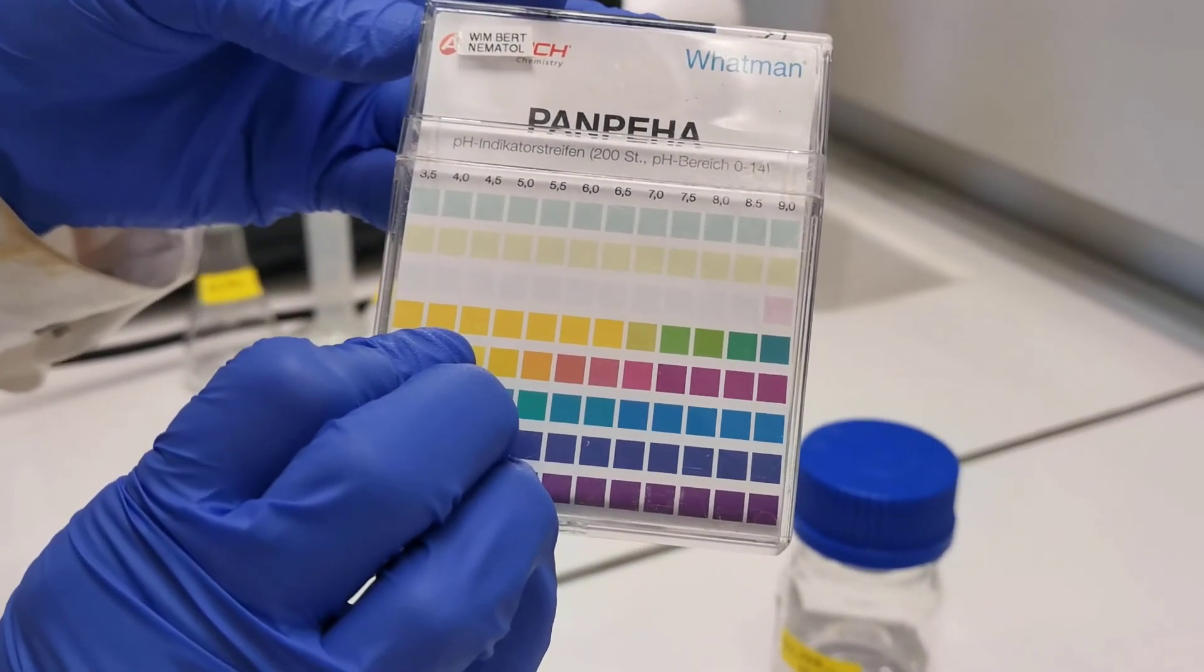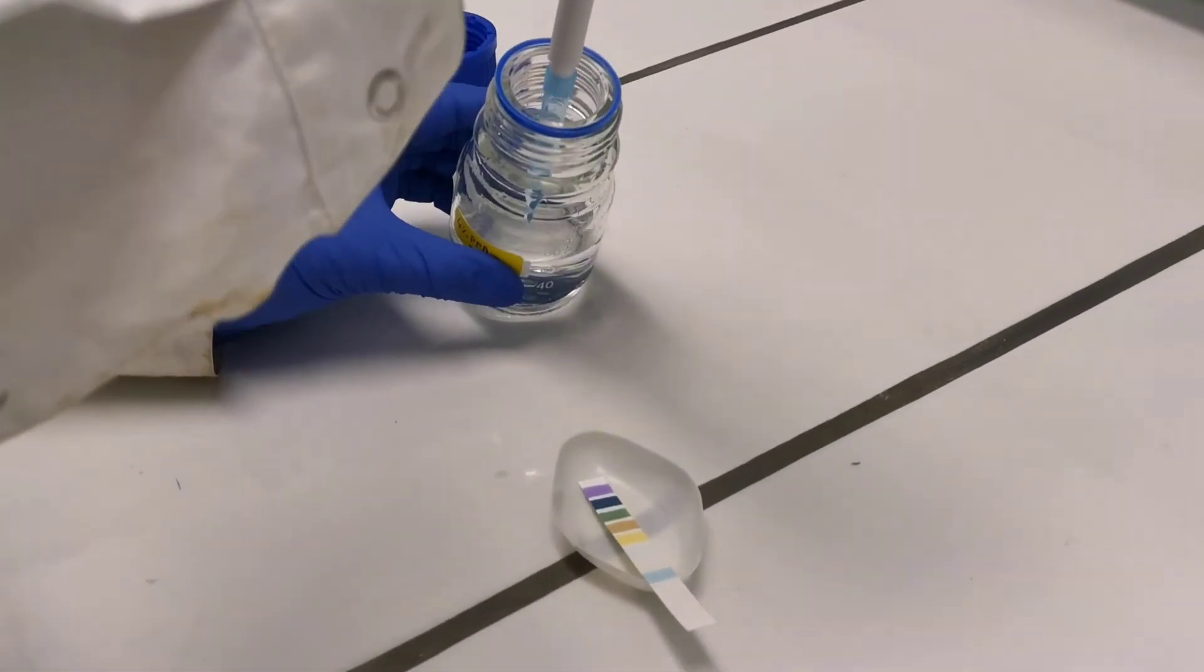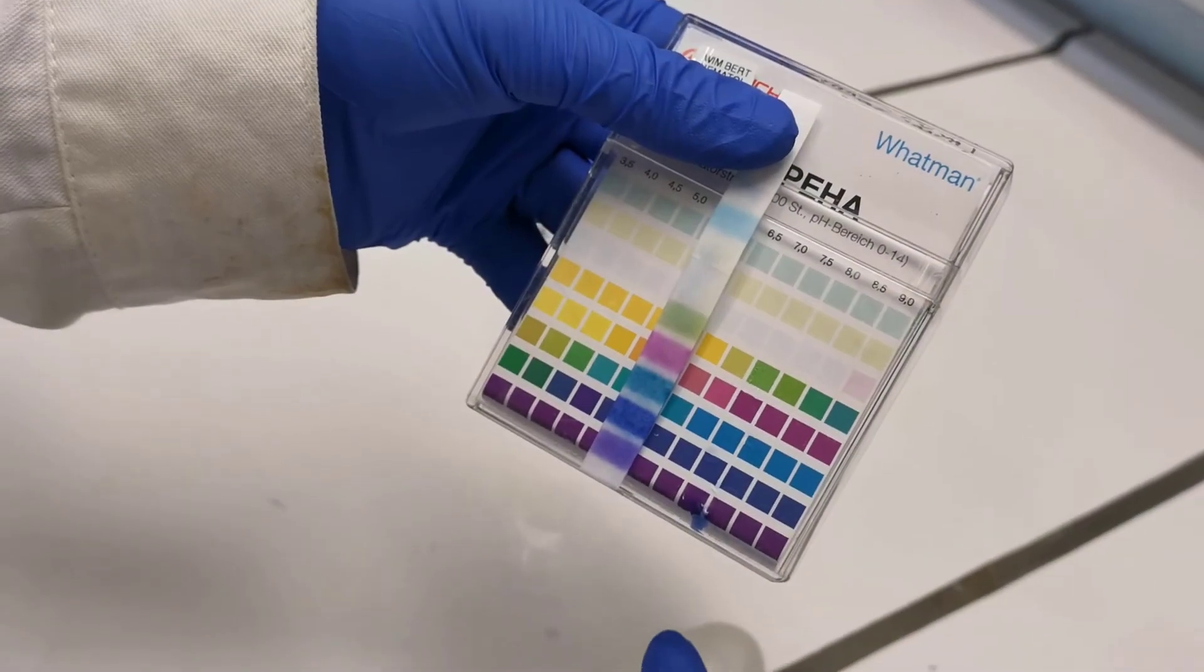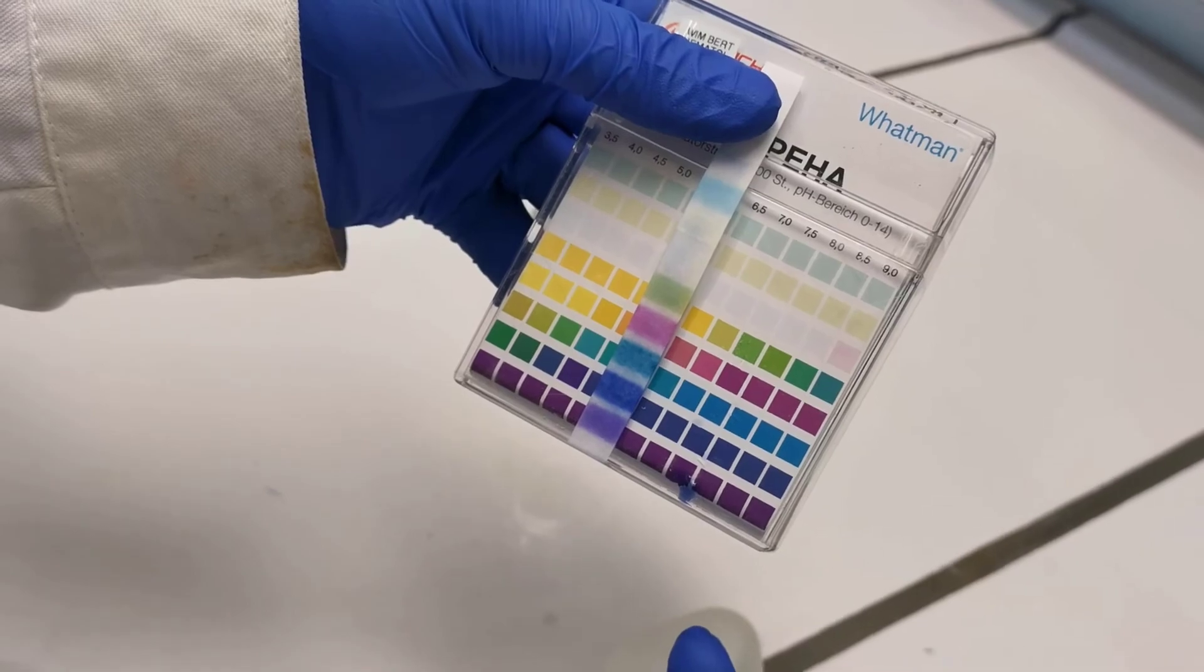The pH of the fixative should be checked at room temperature. You can use one of these pH paper. Add a few drops of the fixative on the paper and check for reference color. The pH should be ideally about 7.5.